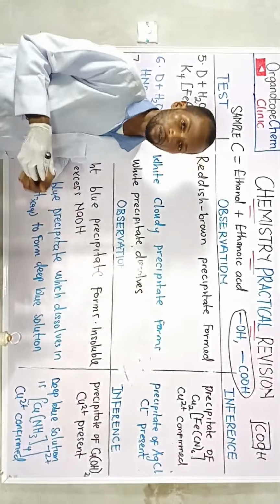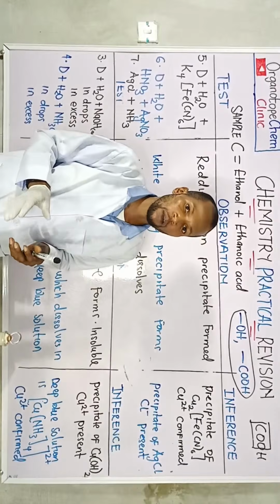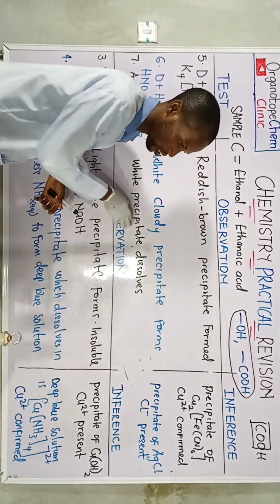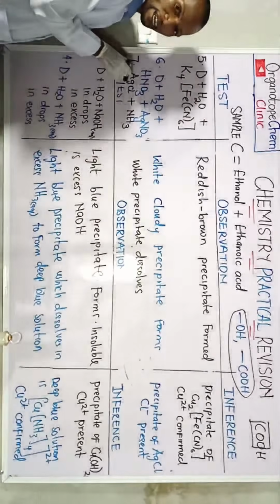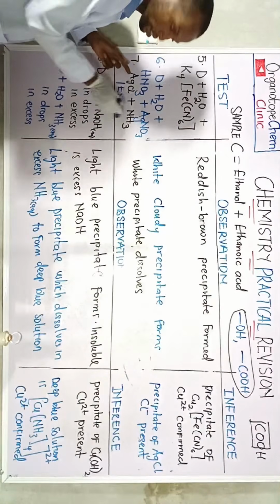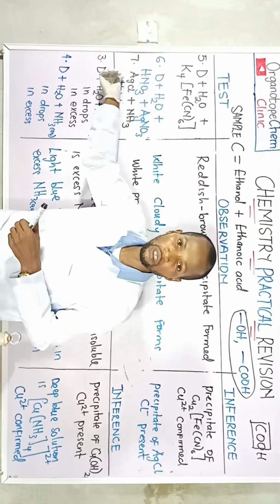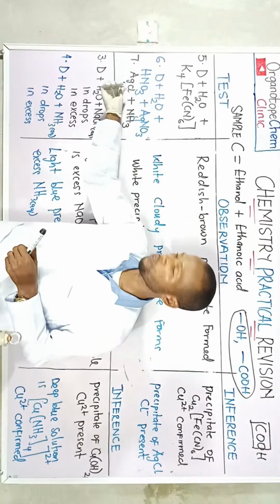White precipitate dissolves. Is that okay? So what has actually happened? We've gotten a formation, there is a complex formed that led to this observation. What complex is that? The silver right here will bond with ammonia. Is that okay? You know that silver has valency of 1 in this case because of the univalent nature of the silver. That is why silver chloride is formed, AgCl.